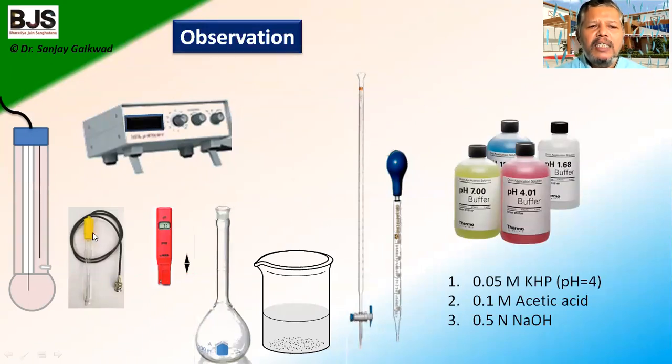With this pH meter, we need the glass electrode. If it is a simple glass electrode, then we require the calomel electrode also. If we use the combined electrode, then it is a single electrode. We can use the pH pen also, the magnetic needle, then glassware, burette, graduated pipette, the buffer solution of pH 4, or a 0.05 molar potassium hydrogen phthalate solution, then 0.1 molar acetic acid solution, and 0.5 normal NaOH solution.